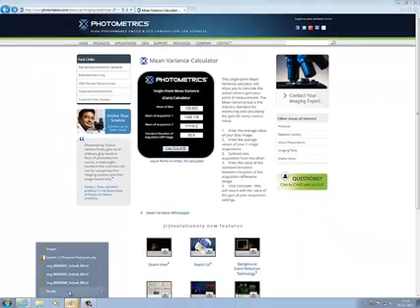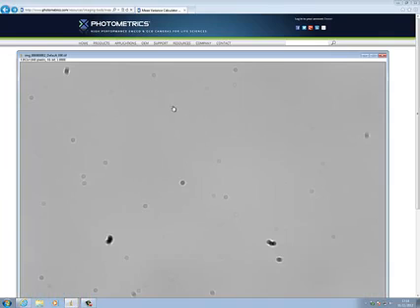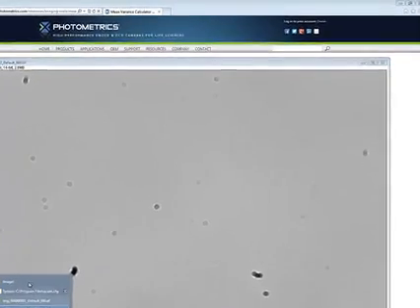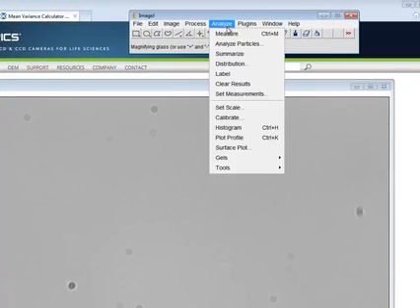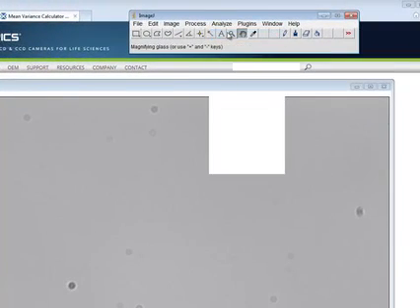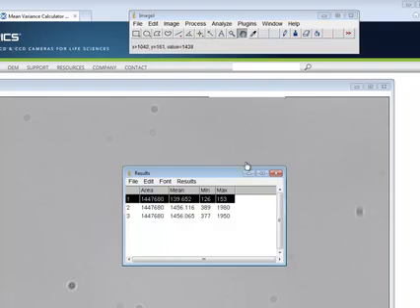Then we need to go and get the next image up, which should be the final one here. Again, up to ImageJ, Analyze, Measure, back to my results: 1456.065.